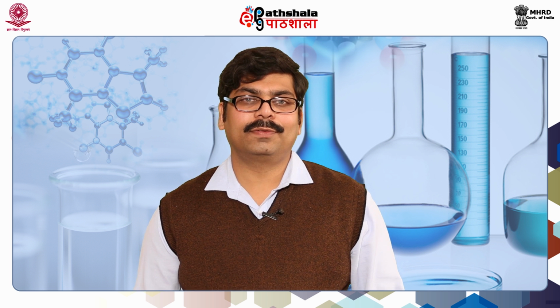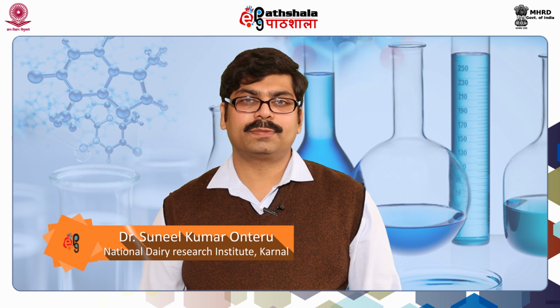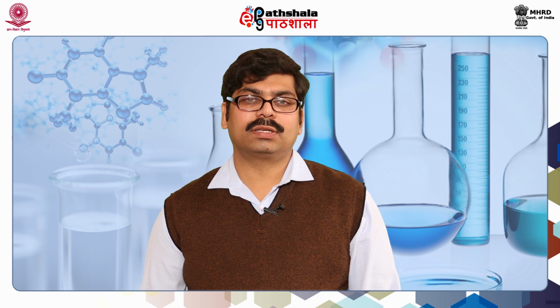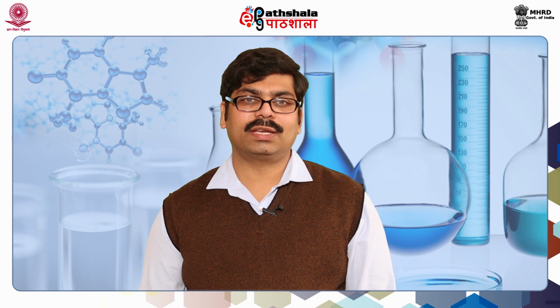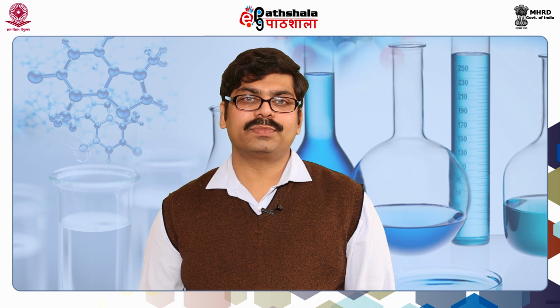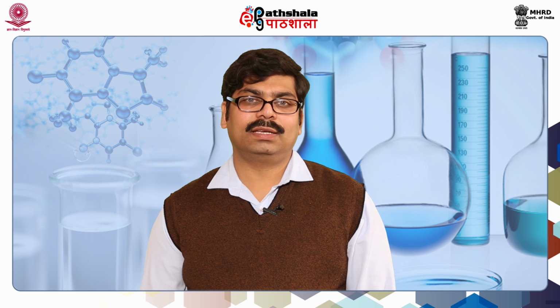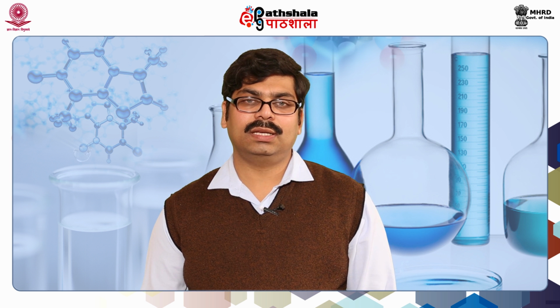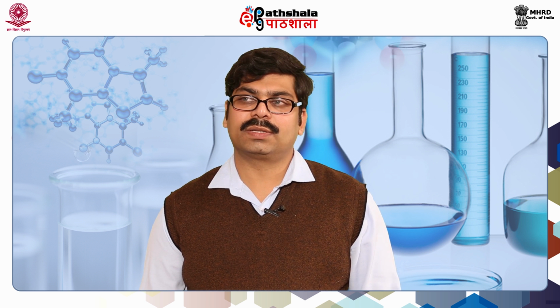Dear students, so far we have discussed the principle of HPLC, instrumentation of HPLC and techniques of HPLC. In the instrumentation we have discussed the mobile phase, stationary phase, columns and pumps, injector and guard column, and finally we have discussed different detectors and the algorithm that can be used to choose the best detector in HPLC experiments.